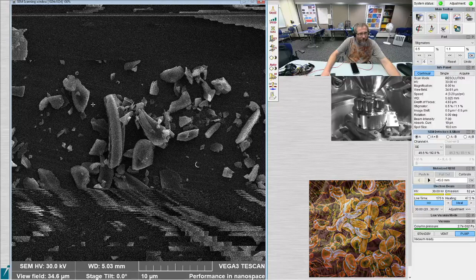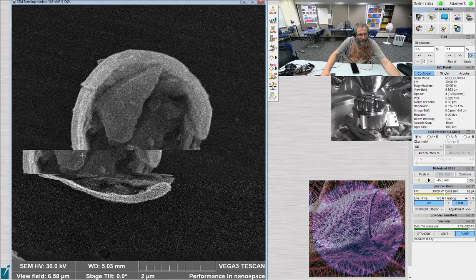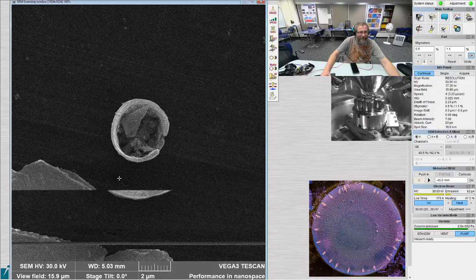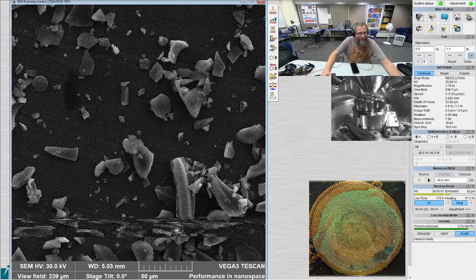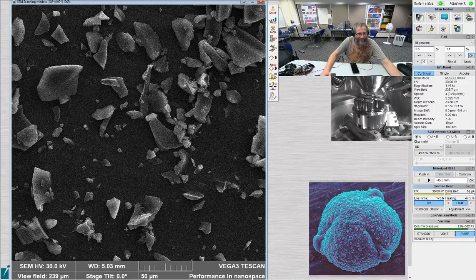That's why we're here. What? That is like a 2.5 micron diatom. I think it's just like a... That's terrible. I think it's like a little fragilaria. I'm willing to just throw that into Staurosira and move on. Yeah, tenera, nothing special. It's unfortunate that it was so full of junk. Right. A little too small. We need to throw that one back and let it grow a bit.